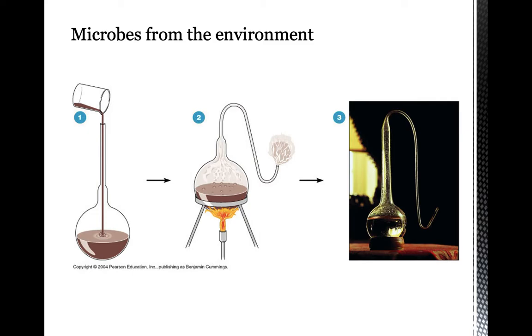Then afterwards, what happened next is, as expected, no aerosolized microbe from the air was able to reach the broth. So it did not spoil. This proves the idea that indeed from the air there are microbes. Once they land on a nutrient-rich surface, they can grow there, and they can get the nutrients from that source.